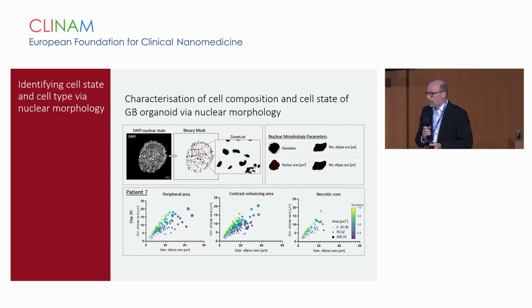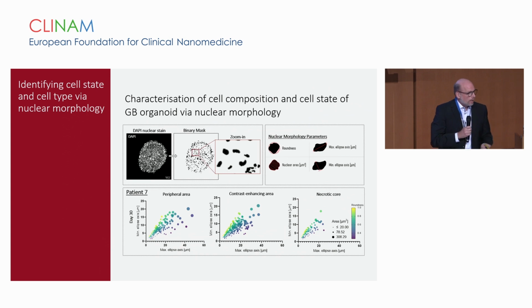And we are now in the process to find some training data sets in order to apply machine learning to speed up this process to analyze all these nuclei. Otherwise, my two PhD students would be counting the whole PhD time, and this is not the purpose of a PhD.